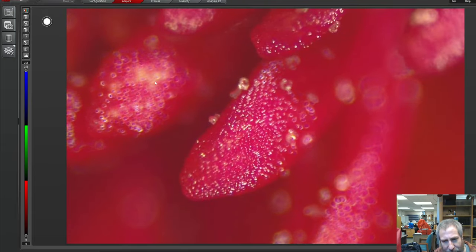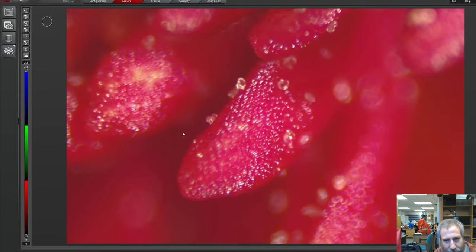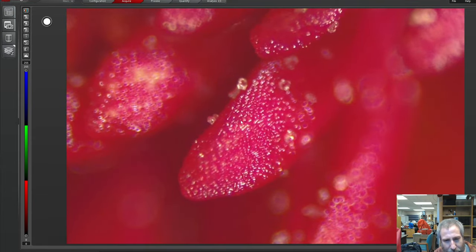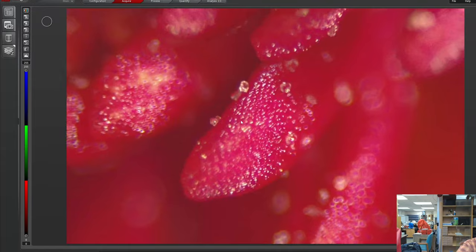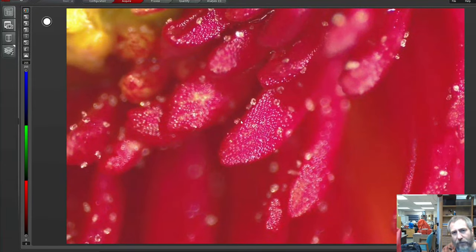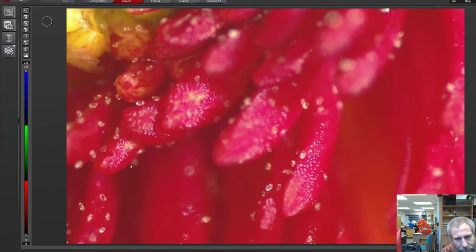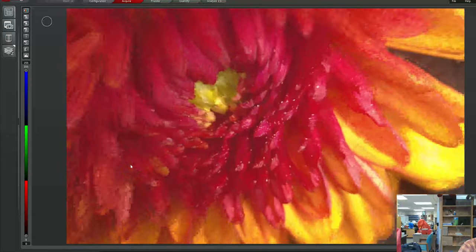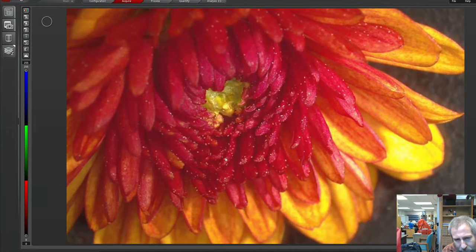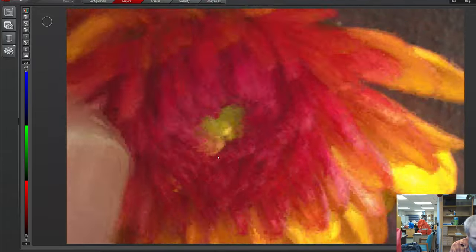So the flowers make their bright colors and sugar and trick poor unsuspecting insects into carrying their pollen around for them from one plant to another. And that's how they multiply. So that's kind of cool. There you can see we were zoomed in on the pollen-y bits. And nice pretty colors. Something bright for the few times we come over to the light side.